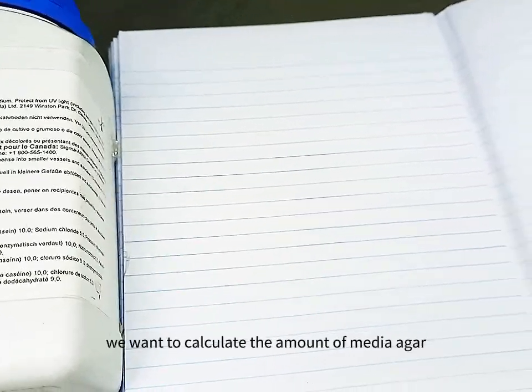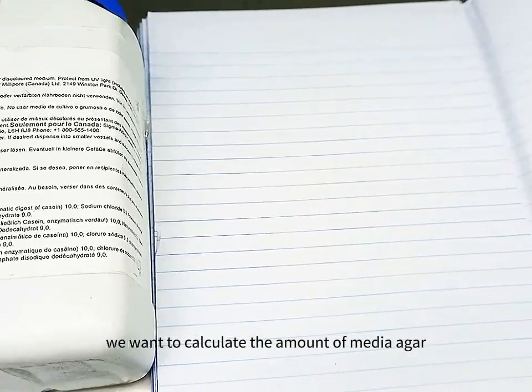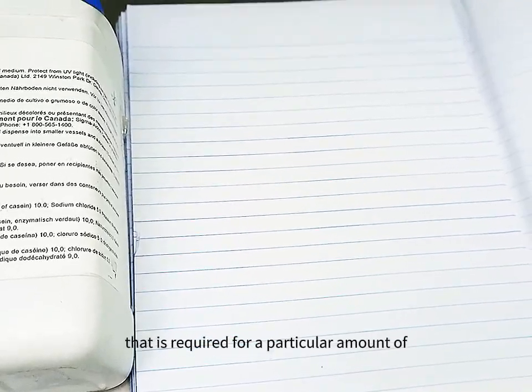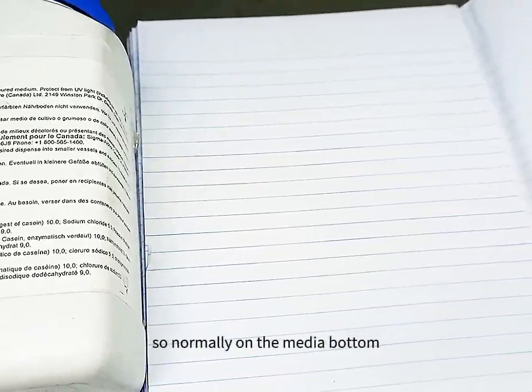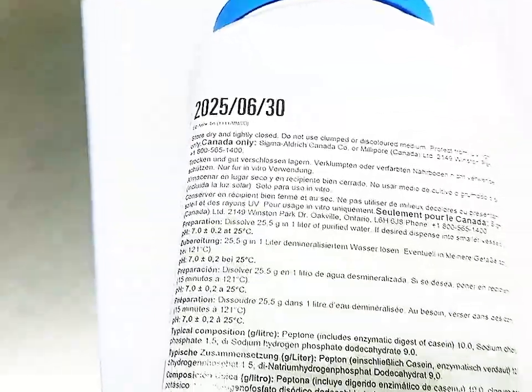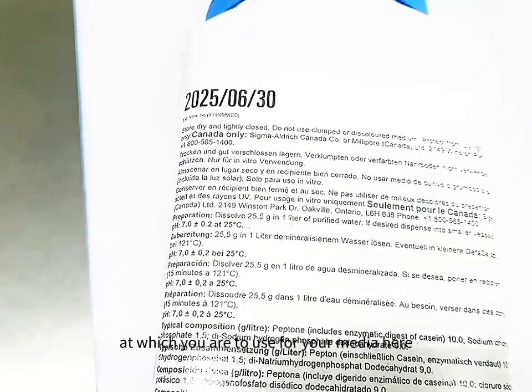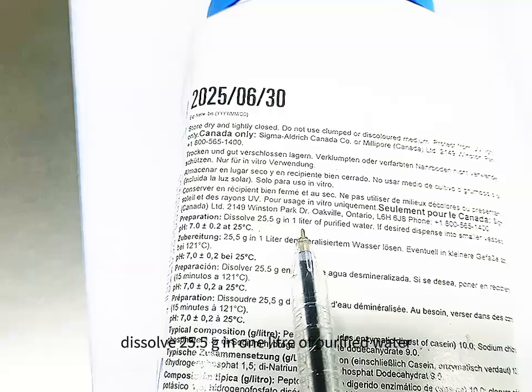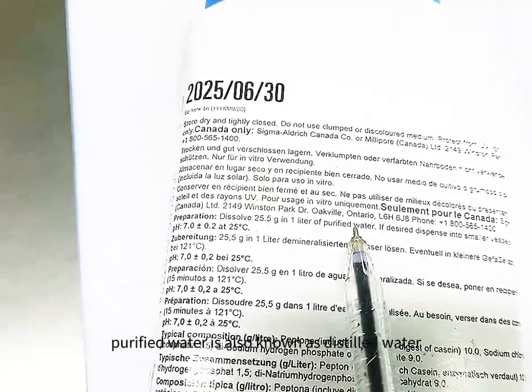So now we want to calculate the amount of media agar that is required for a particular amount of media that we want to prepare. Normally on the media bottle, it is always stated the prescription at which you are to use for your media. Here they said preparation: dissolve 25.5 gram in 1 liter of purified water. Purified water is also known as distilled water.